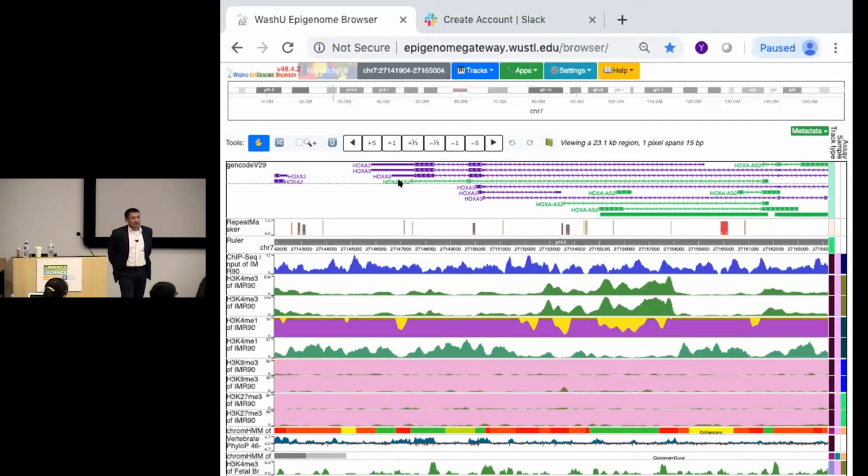It's live, but my collaborators could look at this and say, wait a minute, what about this track? What about this region? And that person could actually do something, and it's still live, shared. Can you do that? That's exactly what it offers. It's not one direction, it's multi. So you can share the same session ID with 15 people, and you can all do the manipulation. It's a totally shared workspace. But when that happens, it's really the time order of events that matters.